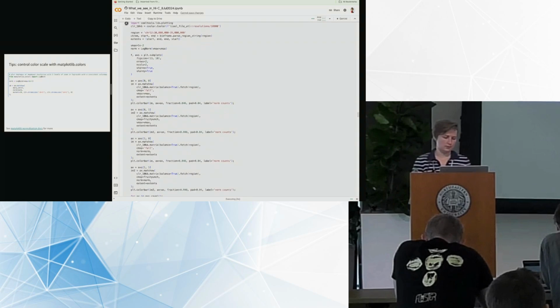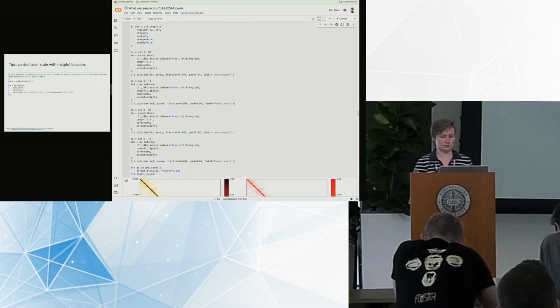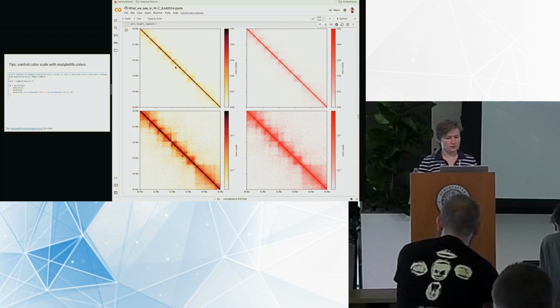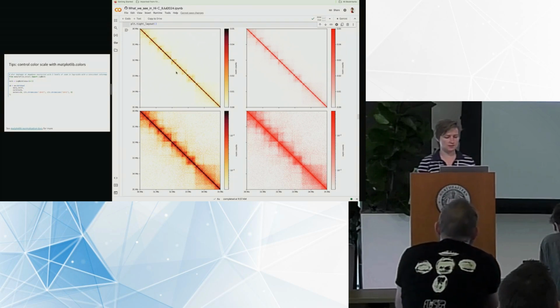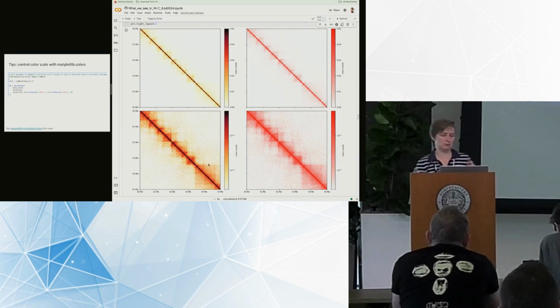And here I give you an example of a higher-resolution dataset. So I load a cooler file at 10 kb resolution now. I define another variable containing the cooler file with 10 kb, and acquire a much smaller region of the Hi-C matrix. And here it goes. You can see what color map is actually more helpful and what scale, linear versus logarithmic, is more useful. In my opinion, local features are much more visible with the linear scale. You can see the dots and stripes very nicely, while logarithmic scale allows you to see domains, more broad structures.